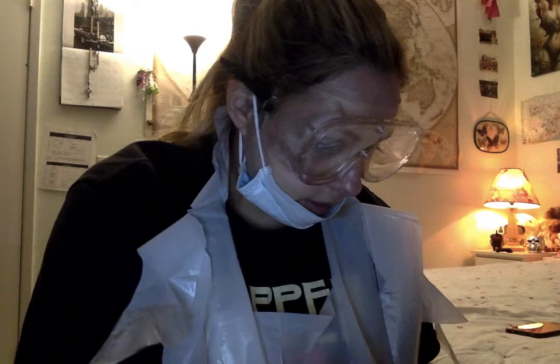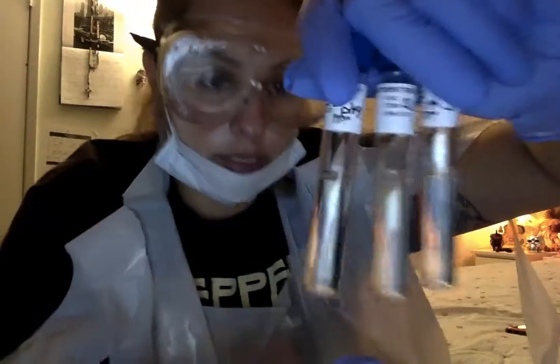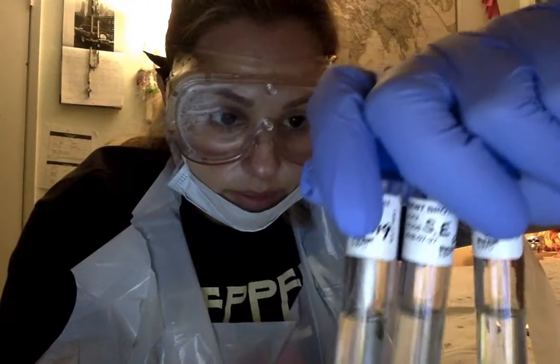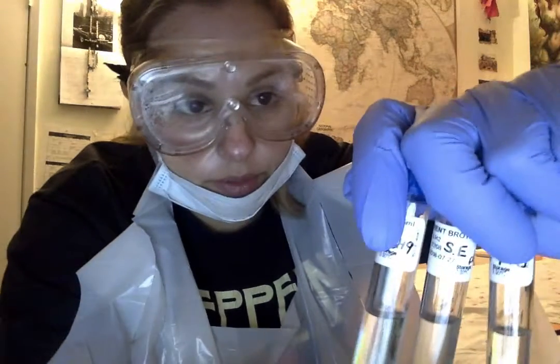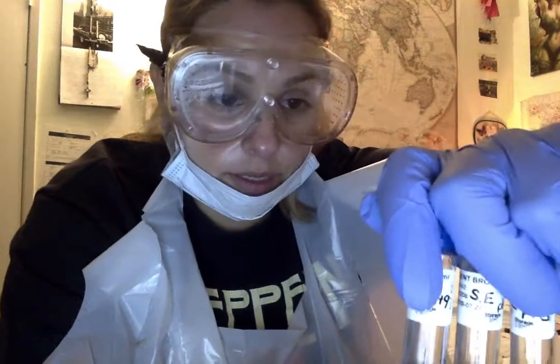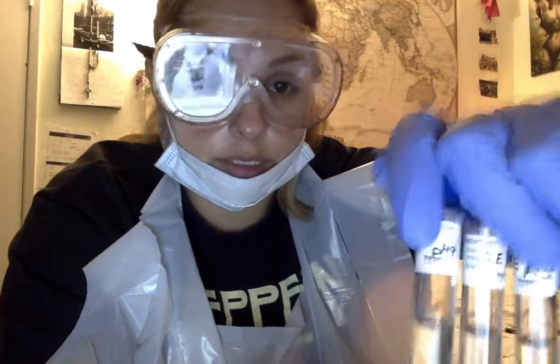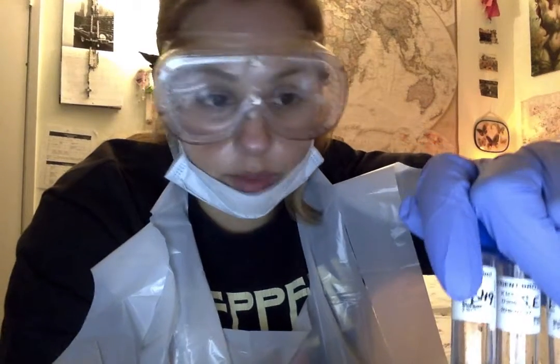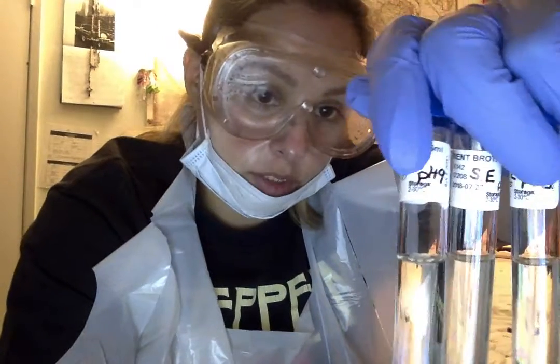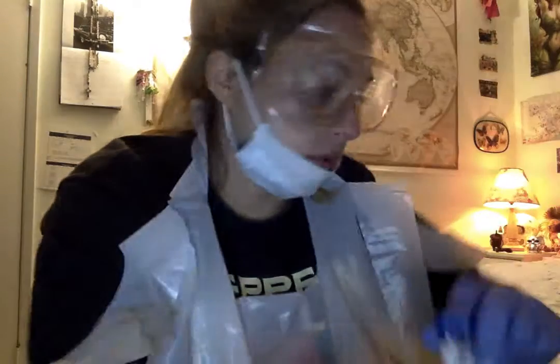We'll start with the S. epidermidis. So that's here. If you take a look, it's kind of hard to tell, but the only one of these three that I see had turbidity was the one in the middle. The one in the middle is the pH 7, which is the neutral one. In this one, we only added the S. epidermidis culture to it because it is already at its correct neutral level, which is 7. The other ones didn't really show anything as far as HCl or NaOH, so not much microbial growth there.